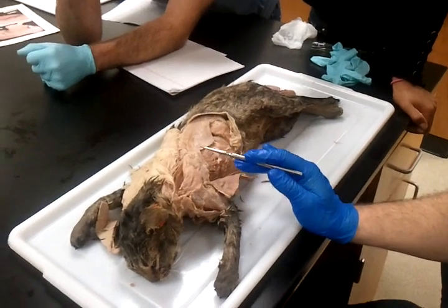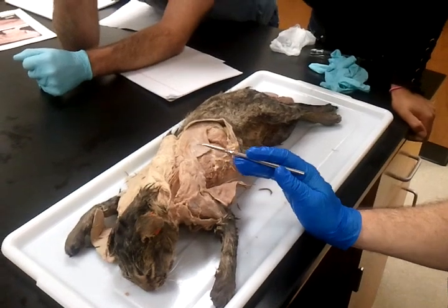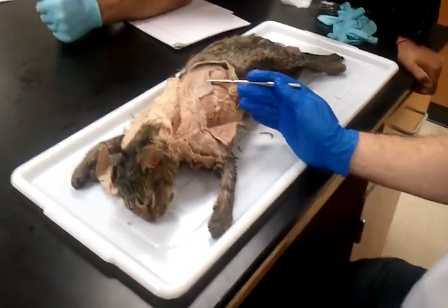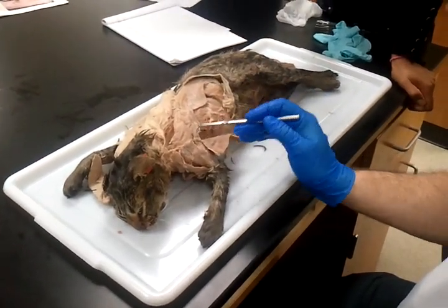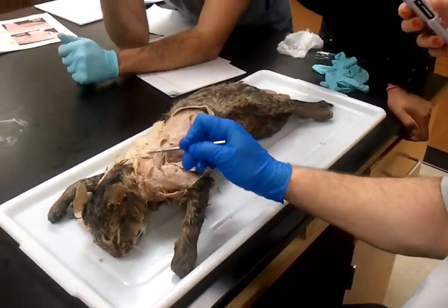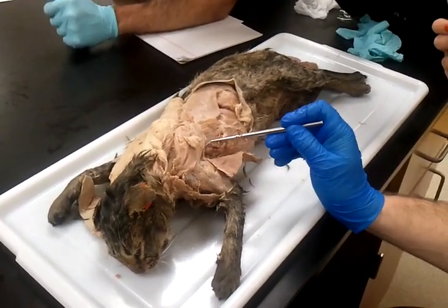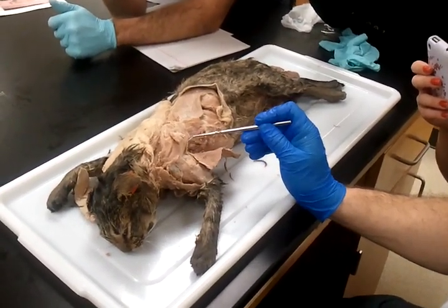Now, in cats, for the most part, it's about 90% of the time, major muscles are smaller than minor muscles. Okay? In humans, you expect pectoralis major to be bigger than minor. But in cats, it's the opposite. With very few exceptions, and one of the exceptions right now is this muscle here. Right underneath here, I don't know if you can see it, but if someone else has a glove, they can help me with this. Right here. This is called teres major. Teres, T-E-R-E-S, means true. So this is a true major.